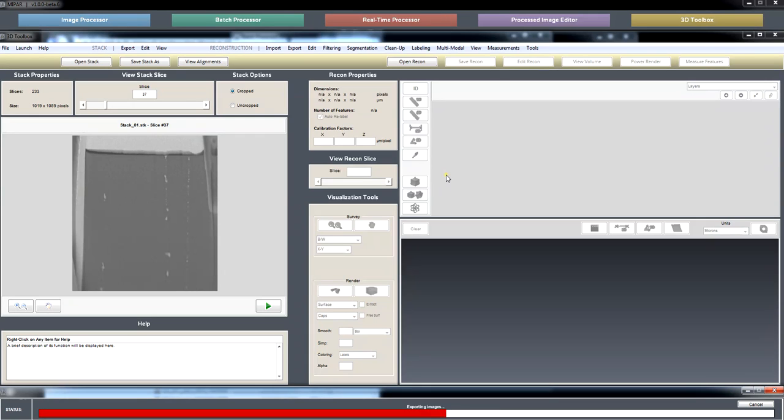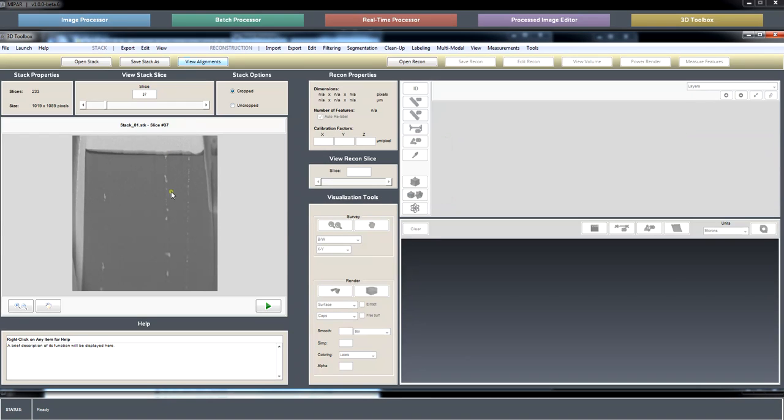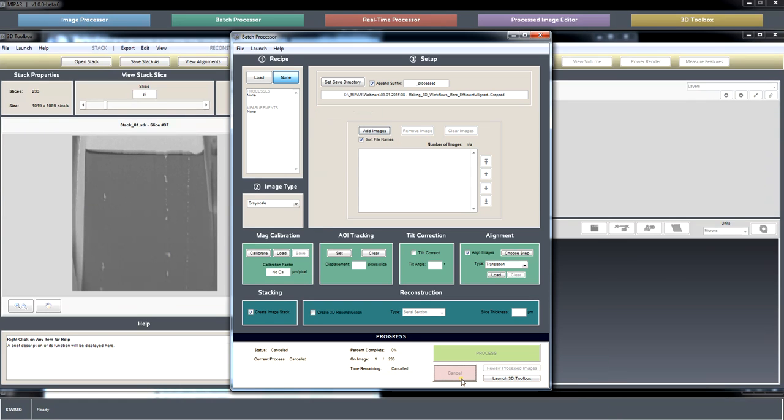set up, and this has been most helpful for our dual beam data sets, an initial area of interest on the first slice, and then calculate what that upward drift in fact is, and have that box slide through the data set so that you don't sacrifice more volume than you need to by trying to fit a crop box to the volume that stays mutually inside of the area of interest. So that looks like this.